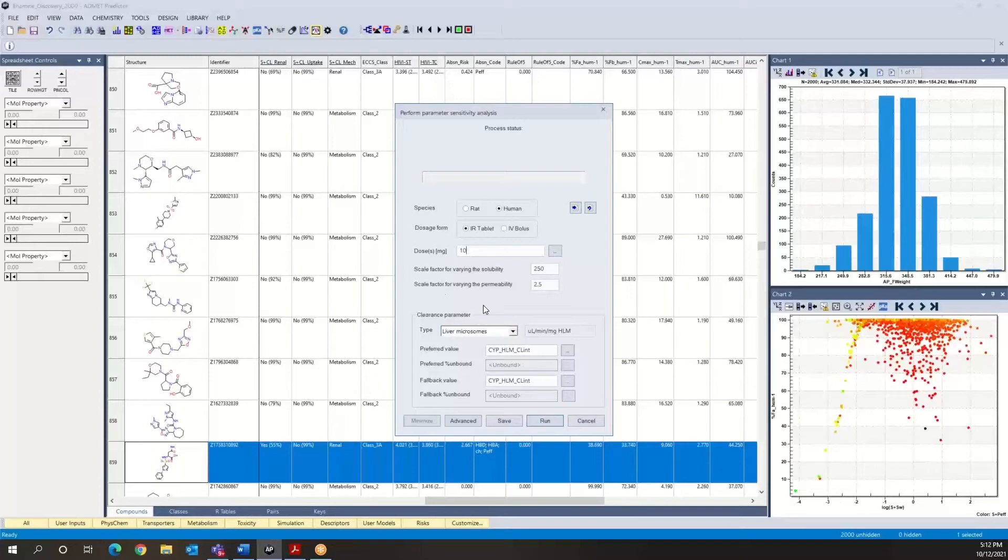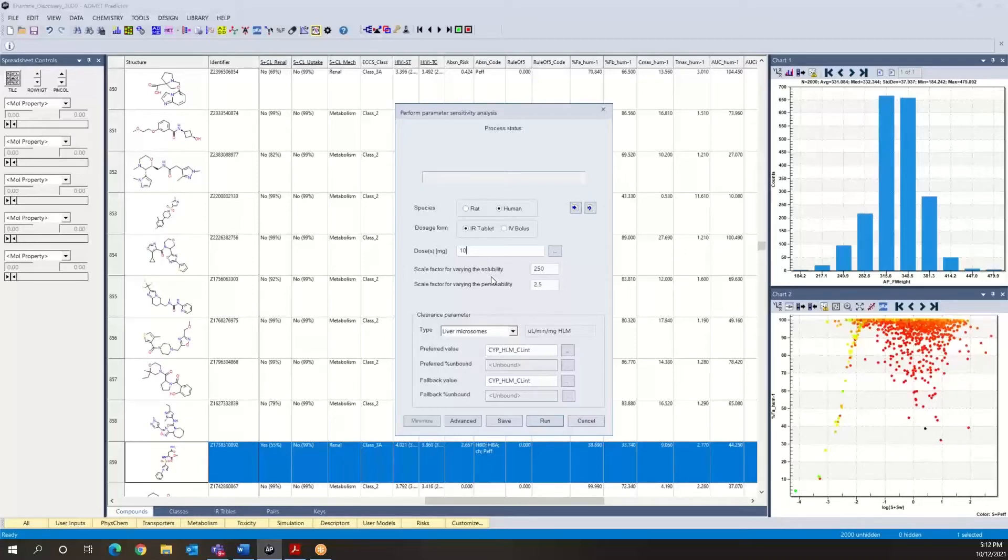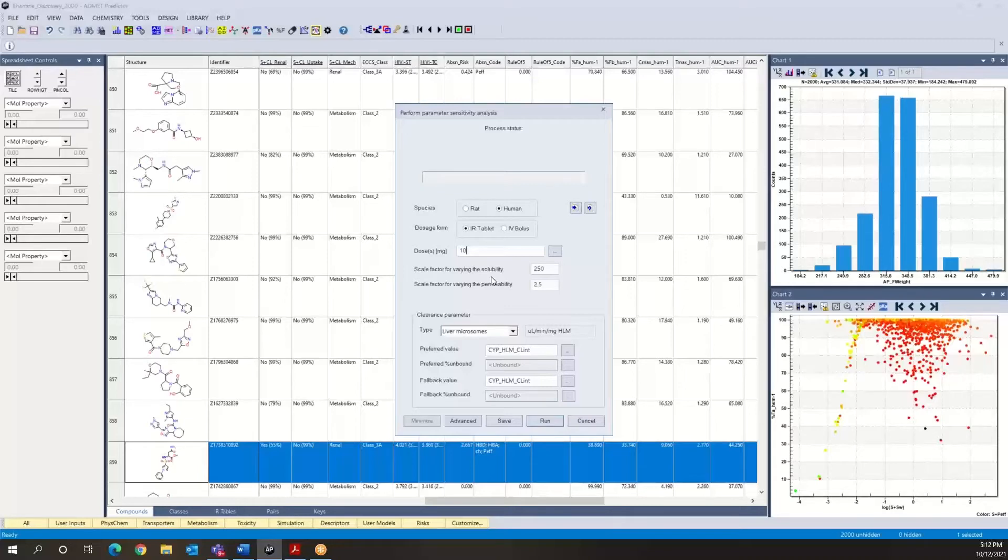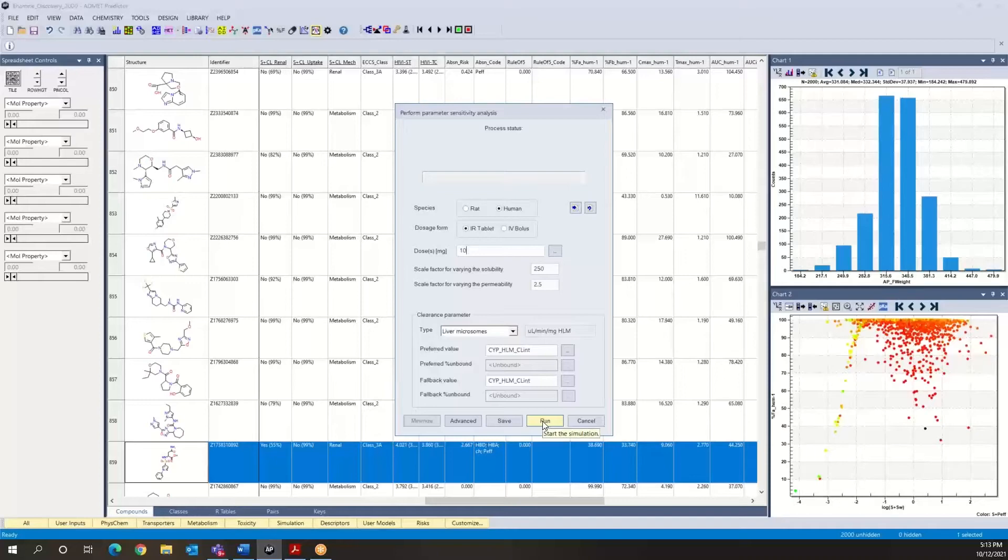Now what the program is going to do is vary both solubility and permeability and see how the fraction absorbed is projected to change as a function of that. The scale for changing solubility is pretty different from the scale for changing permeability, and that's because these two models have very different ranges. There's a much larger range of solubility within our solubility model, which is based on experimental data, whereas that range is much smaller for permeability. So we're going to select this compound and run a parameter sensitivity analysis.